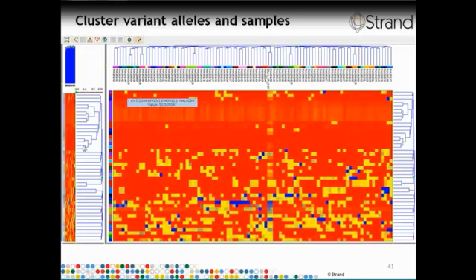So that would clearly indicate that the center sample is the child sample and the other 2 samples are the father and the mother. One can always redraw the color bar with the family roles, father, mother and child, to confirm that hypothesis.